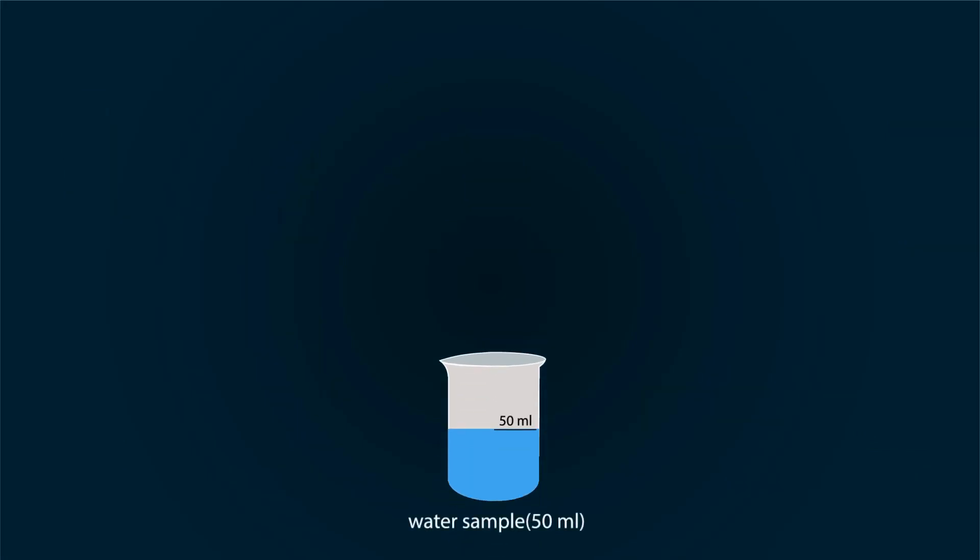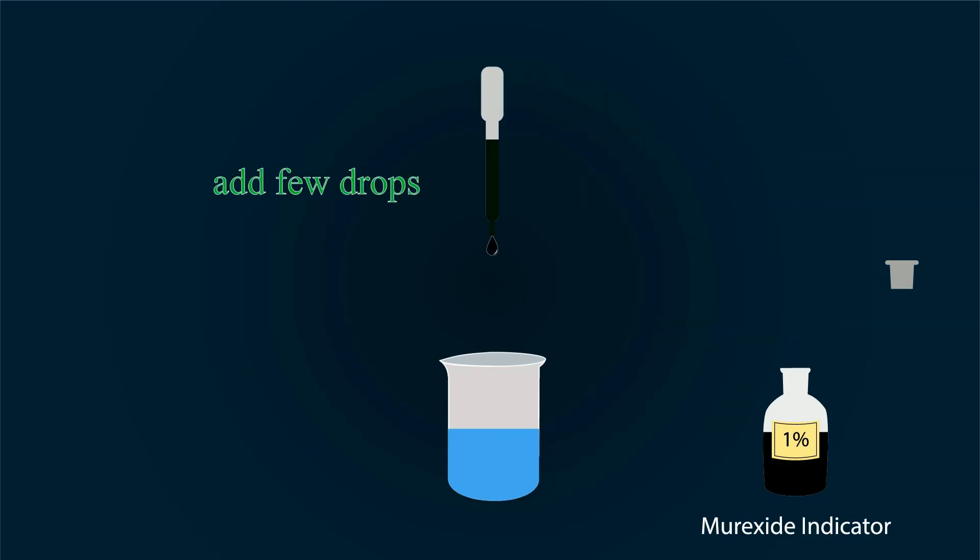First of all, take a 50 milliliter water sample in a beaker. Now take 1% solution of Murexide indicator, and add a few drops into the water sample with the help of a dropper. You will see as you add the solution, the color of water will change into orange.